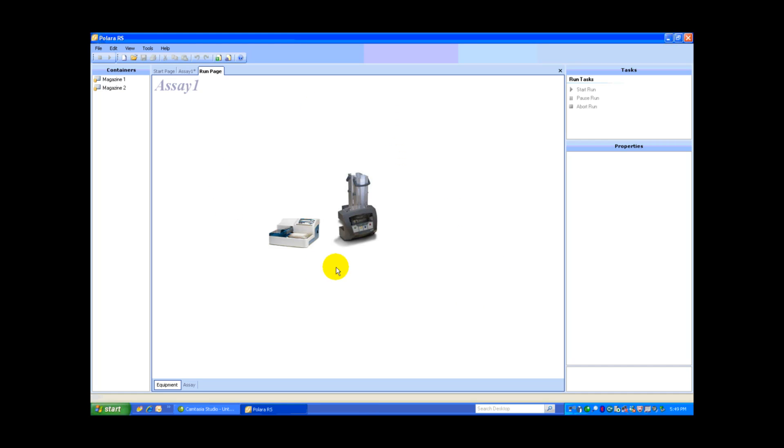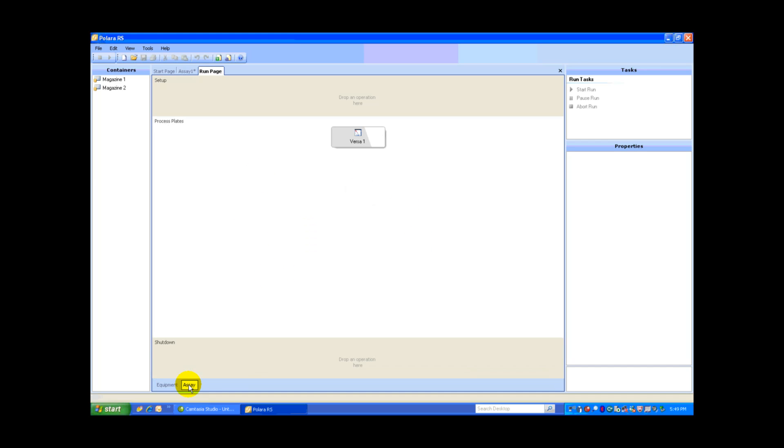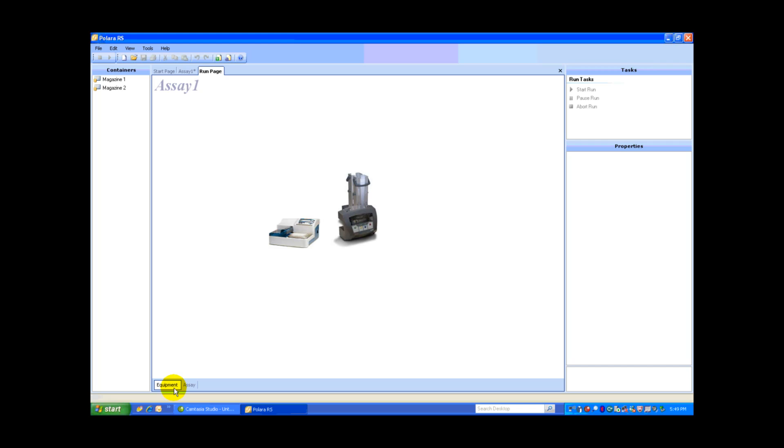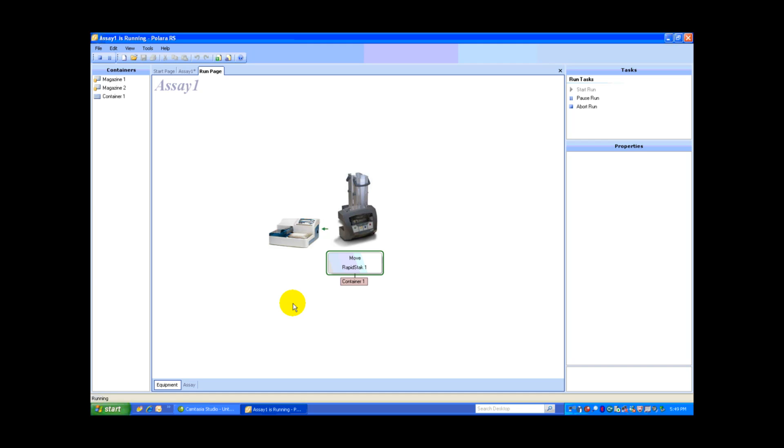What you're going to see is the Equipment tab open. I can also switch back to the Assay tab, but we'll stay on the Equipment tab. What this is going to do is show you all the plates being processed and the status of those plates. So right now you can see that the RapidStack is retrieving container 1 and it is moving that container over to the Versa.